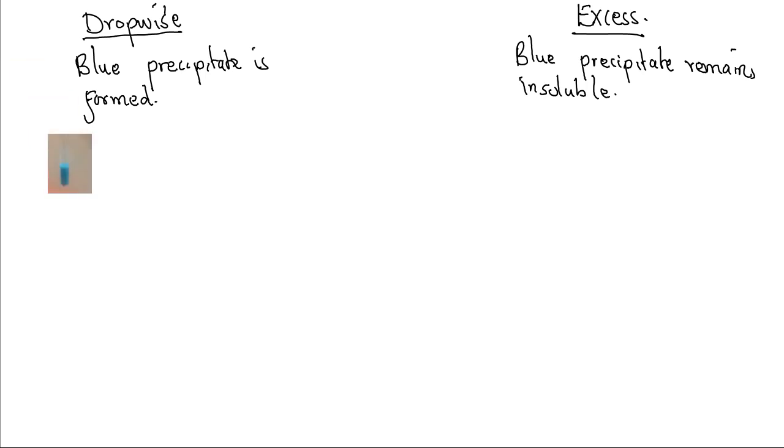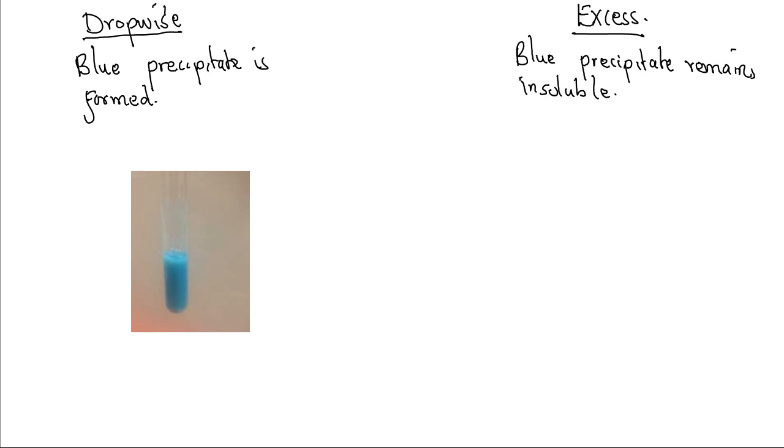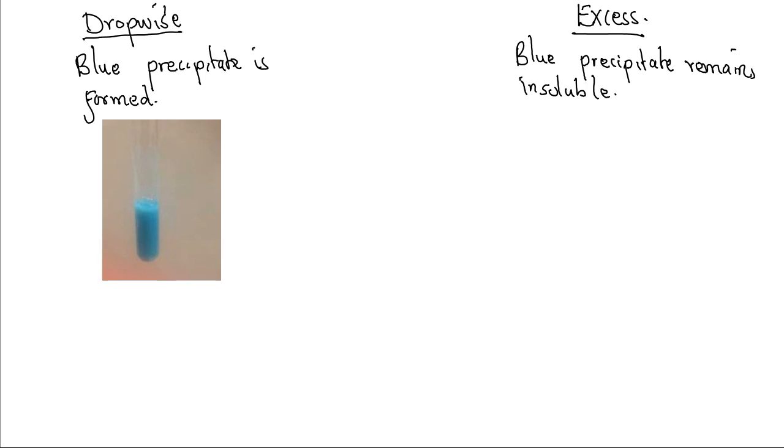When you add excess sodium hydroxide solution, we will still have the blue precipitate being insoluble.